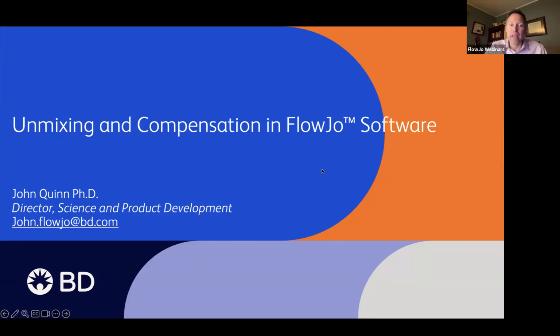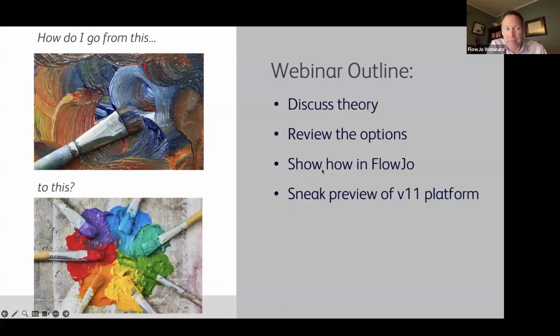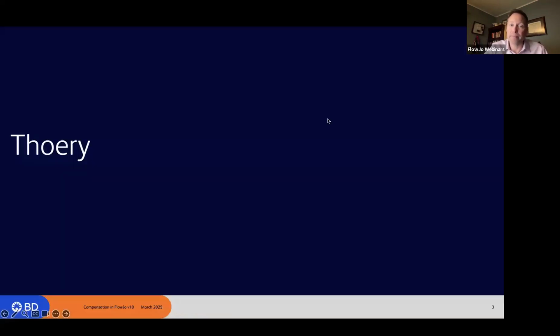The plan for today's webinar is that I will briefly do the theory behind compensation and unmixing. We'll review what the current options are, and then I'll show you how to do it in FlowJo. And then at the end, we'll see if we can sneak in a preview of how unmixing and compensation are done in version 11. All right, so let's do it.